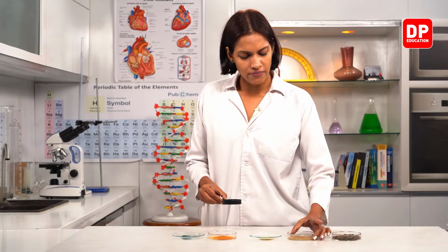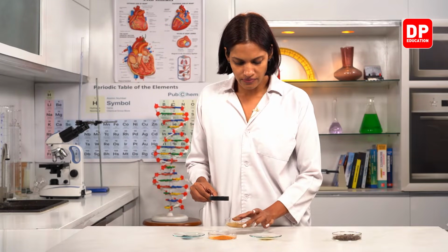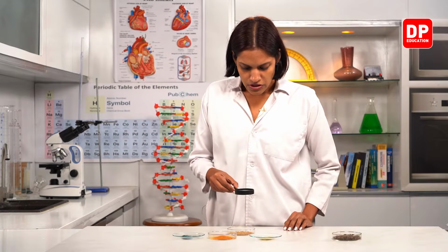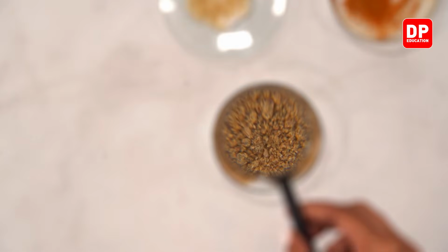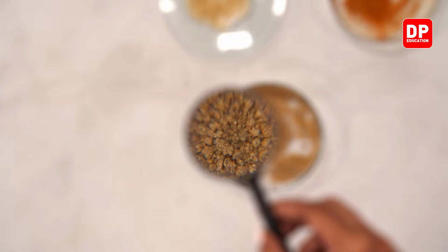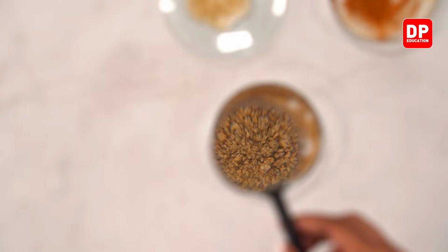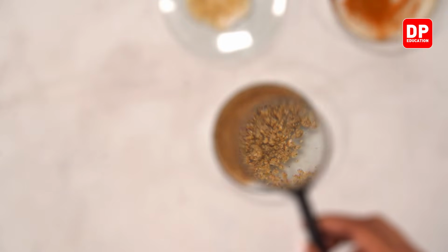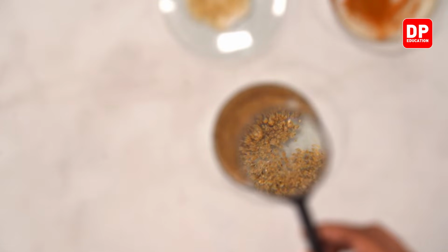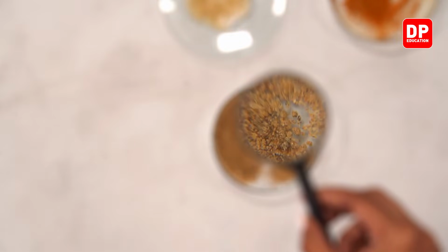Now I have the sand sample here. We'll observe this one as well, right? So here I can clearly see different sized sand particles. Can you all see, children? Sand particles are there. Very small stones are there. You all can see very clearly there are some black color particles.